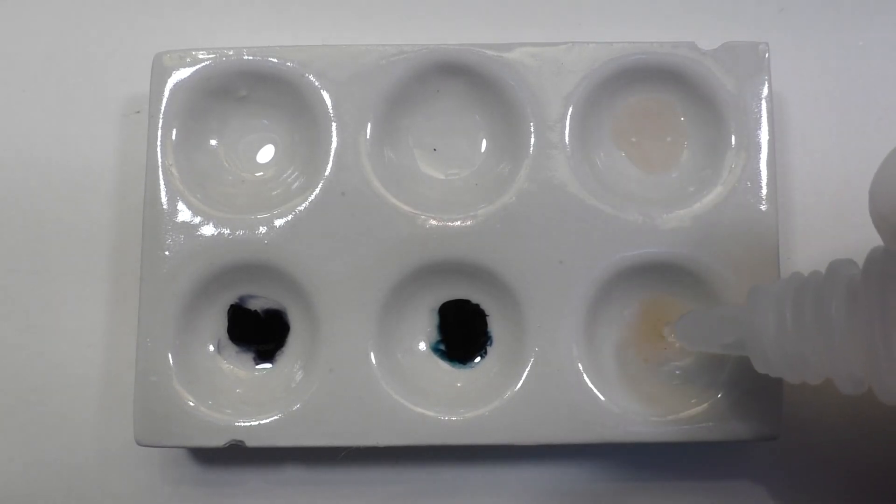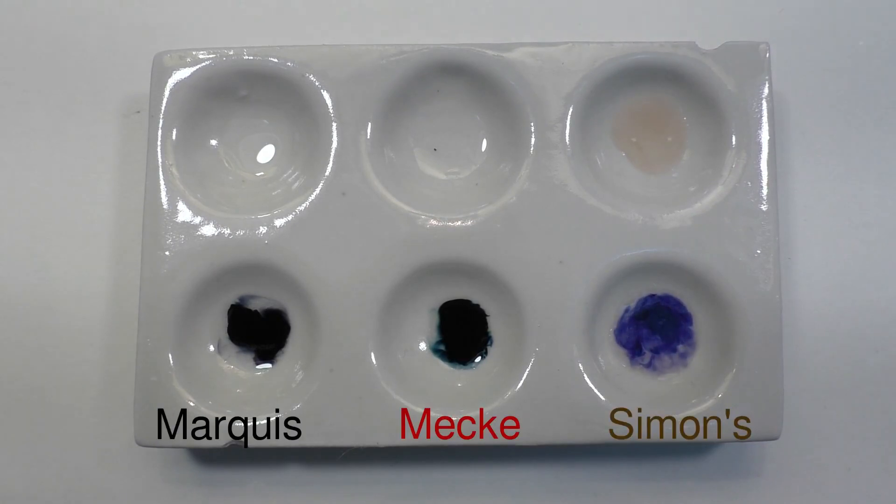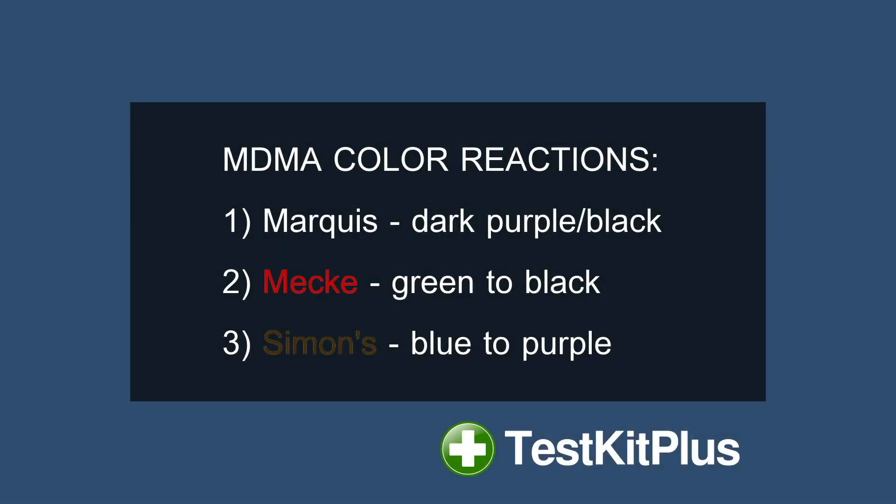A blue color is what we get right here. These results are consistent with what we'd expect for MDMA. Note that the sample in this video is in crushed crystal form, but MDMA street samples also often come as pressed pills or in capsules.